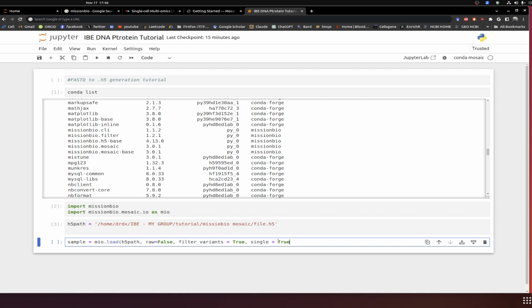Usually we set single as true because each sample is unique and it's important to keep that track in there. And another parameter is that some people add the whitelist. So it's a condition where they set it like okay, even if the filtering exists, we still want our specific variants to be present in there.